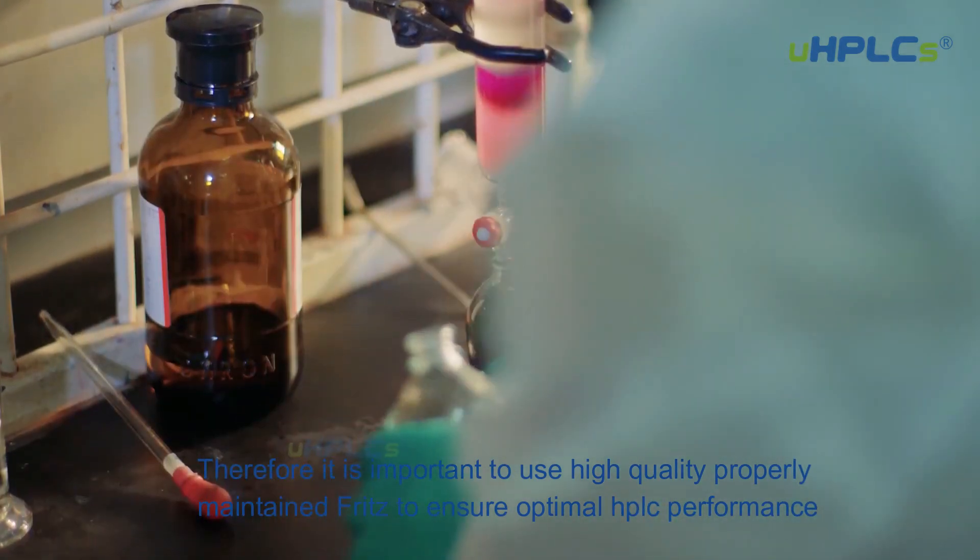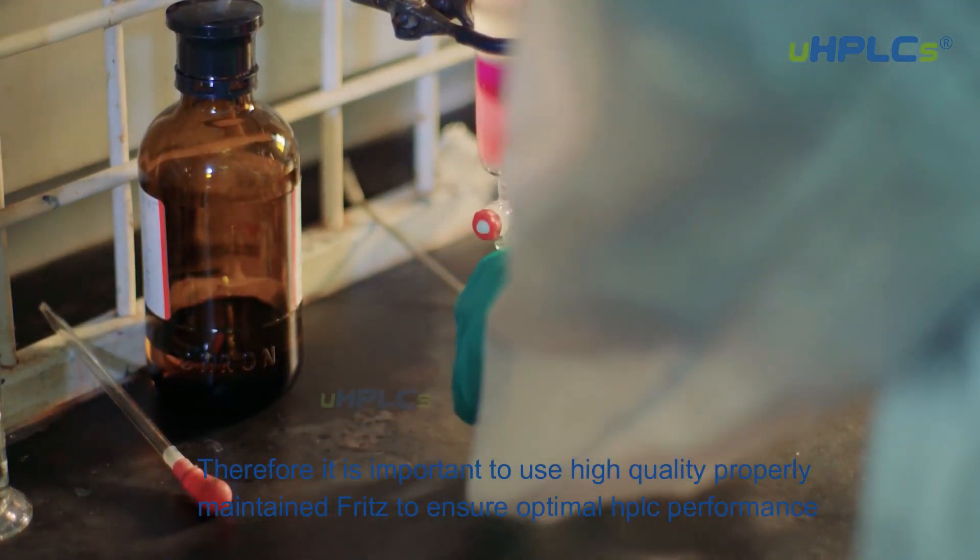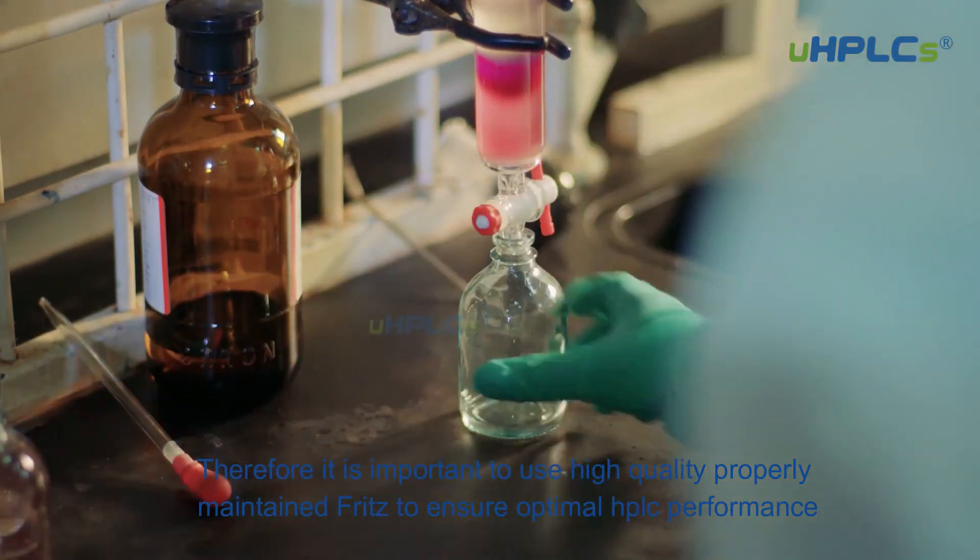Therefore, it is important to use high-quality, properly maintained frits to ensure optimal HPLC performance.